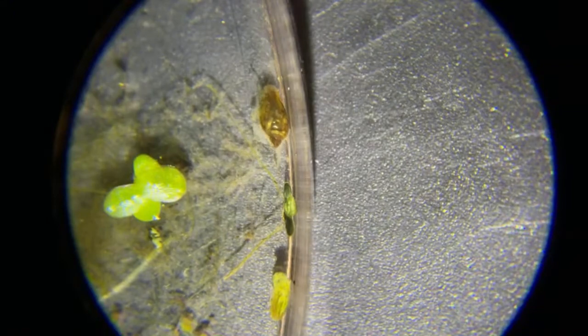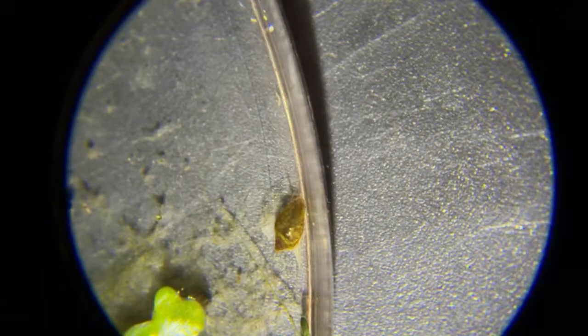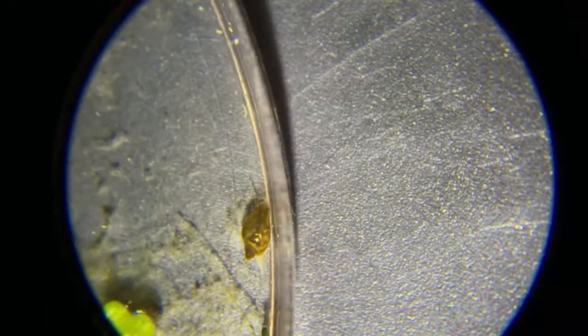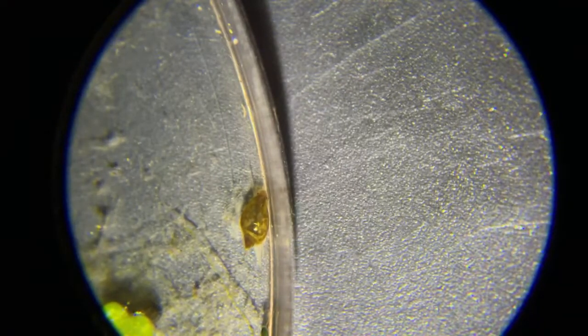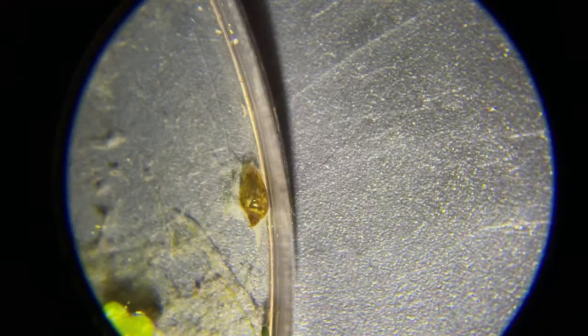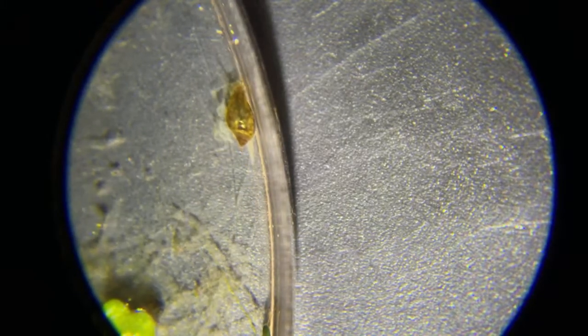Yeah, it's not off topic because I actually was looking for tardigrades when I found him. In my opinion, they are rare. They're not rare in nature, okay? But they're rare to collect and stream live. Let's put it that way. They're rare to go out, collect some moss or lichen, get them in here, and then stream them live.